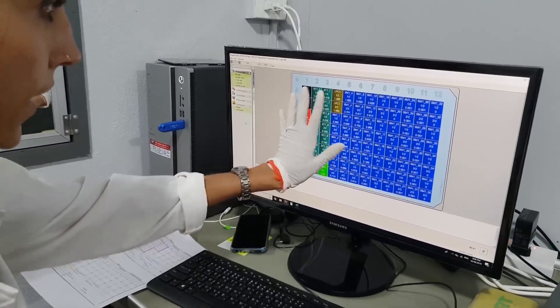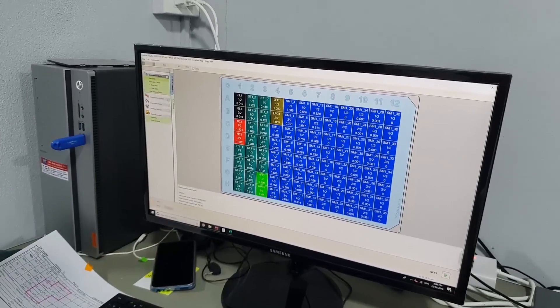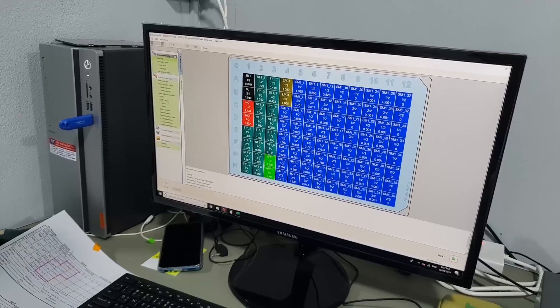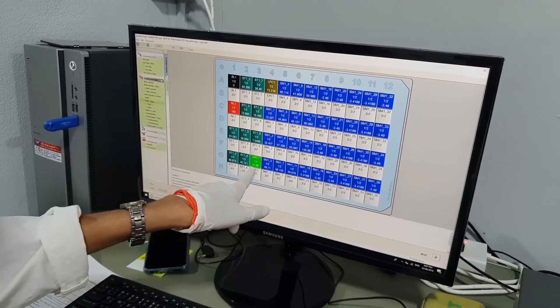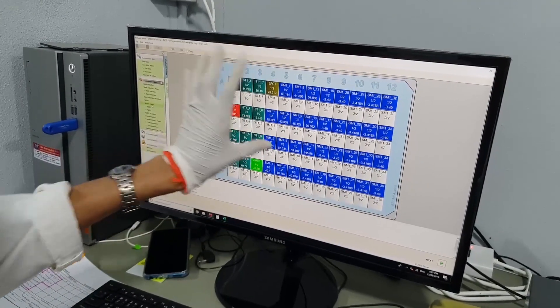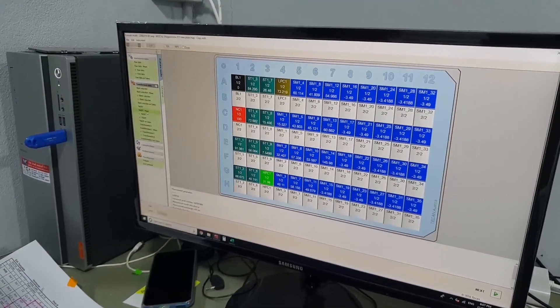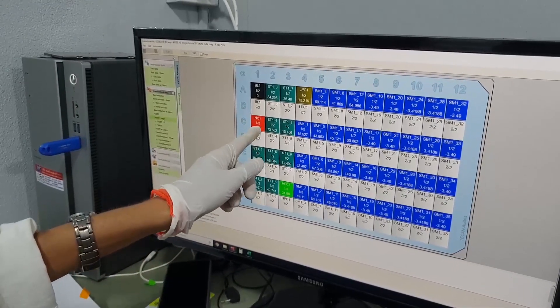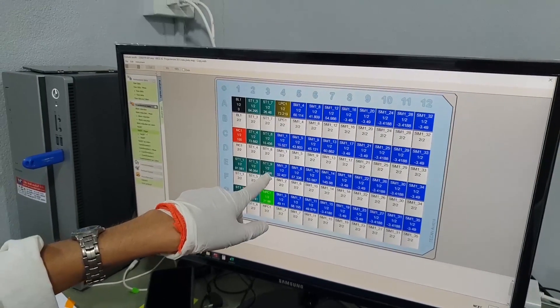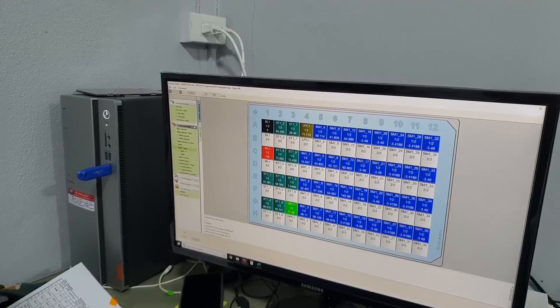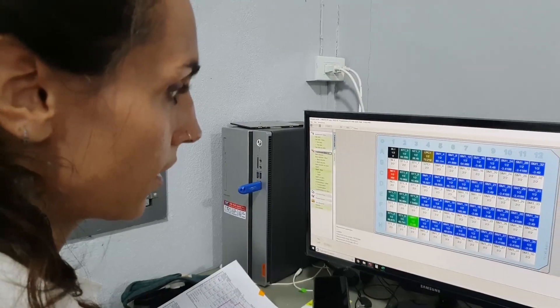So these are the raw data — this is the optical density of each well. The first thing we're going to check is the means, so it's perfect. These are our controls. Our controls need to be at about 30 and 70 percent binding, which means the plate has developed well. We also see that our standards go from the maximum concentration of progesterone to the lower value of progesterone. The standard curve is correct, so we can trust the results.